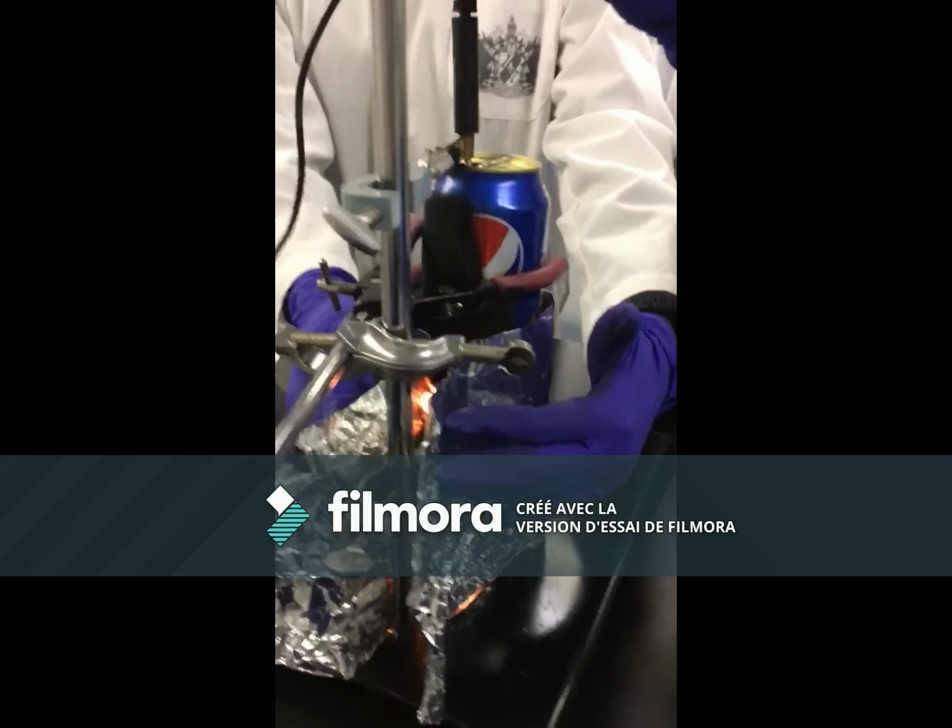Today we compared and verified the energy content of biodiesel fuels and regular fuels. The experimental heat of combustion of ethanol, octane, petrodiesel, biodiesel from soya, and biodiesel from used oil was obtained by lighting a burner containing one of the fuels under a soda can filled with water and calculating the difference in temperature of the water and the mass difference of the burner when the temperature remains stable.